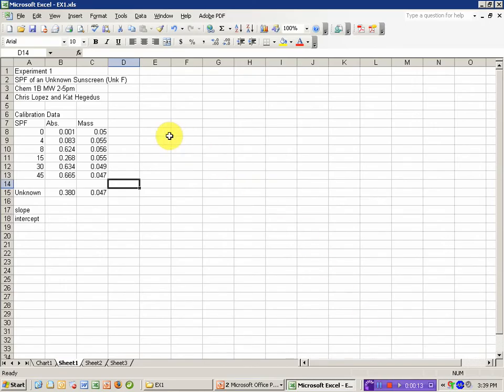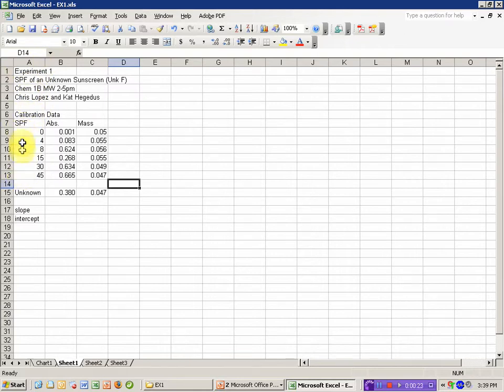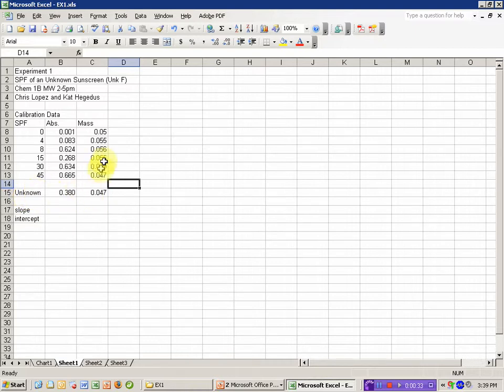I've already typed my data into Excel, including some header information identifying the lab and what I'm doing in this calculation. The data that's collected in the lab, the SPF value for the known sunscreens, their absorbance, and the mass of sunscreen used, as well as the absorbance and mass of unknown used.